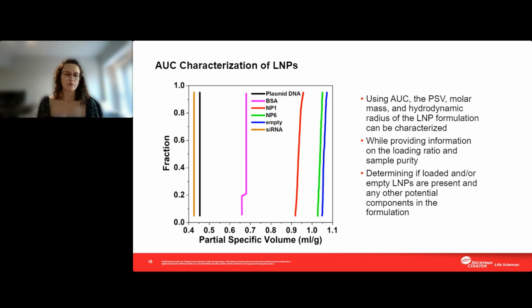And then following this work, one of our collaborators, Alexander Bepperling, furthered the work and published a paper where he was able to use this method and some additional mathematics, and he could calculate the mRNA copy number loaded inside of the lipid nanoparticles. That helps to give a stronger identity too: besides just being able to tell that they're pure, you can tell the distribution of mRNA copy number loaded into your LNP distribution.